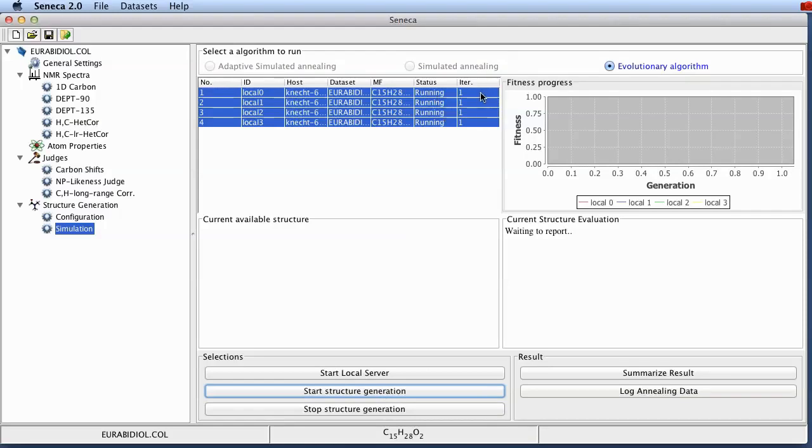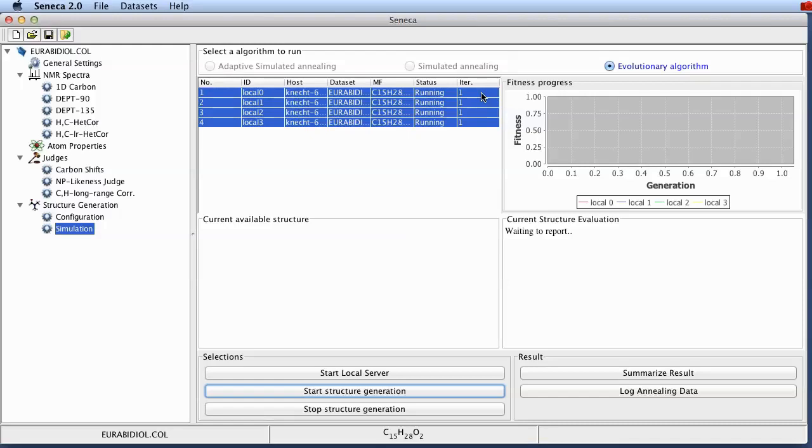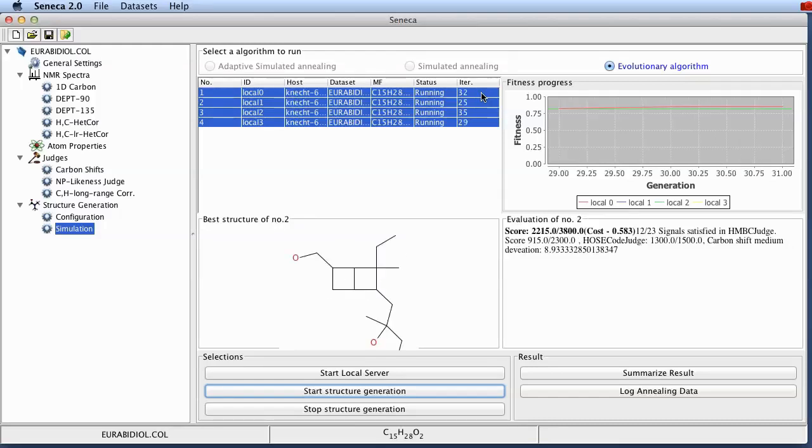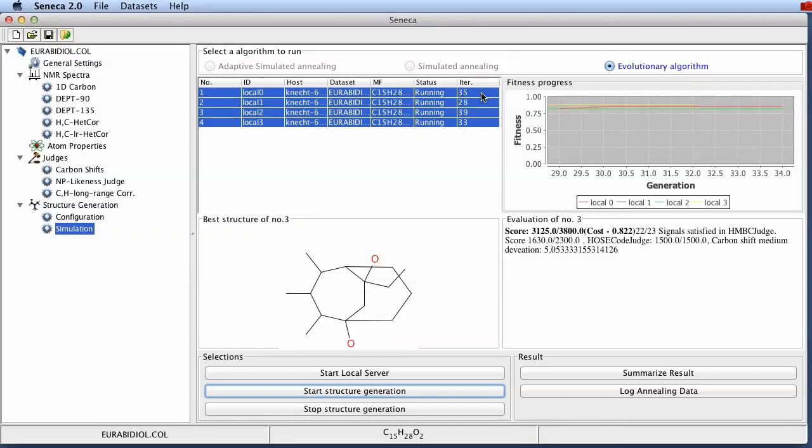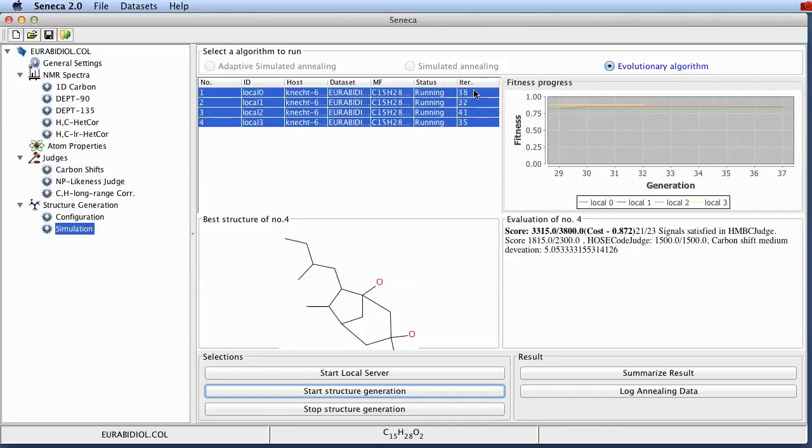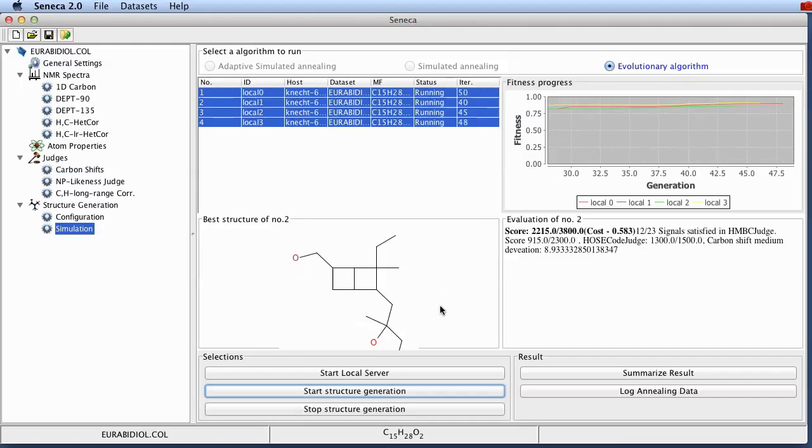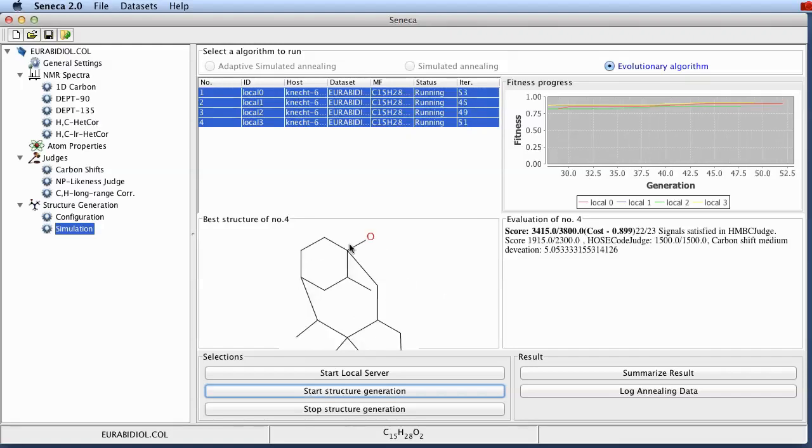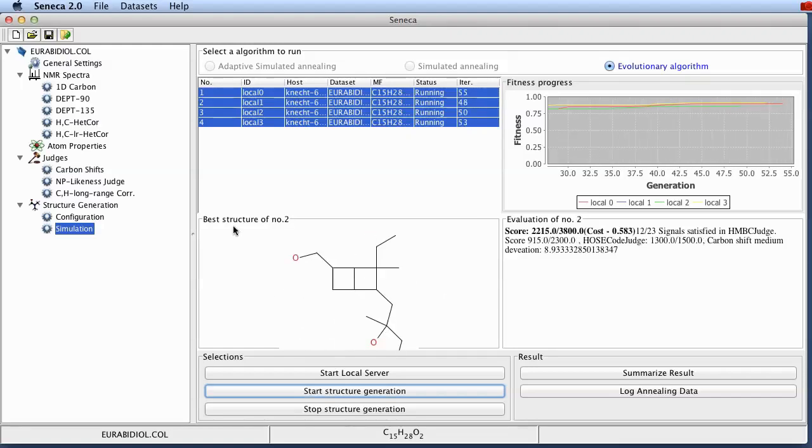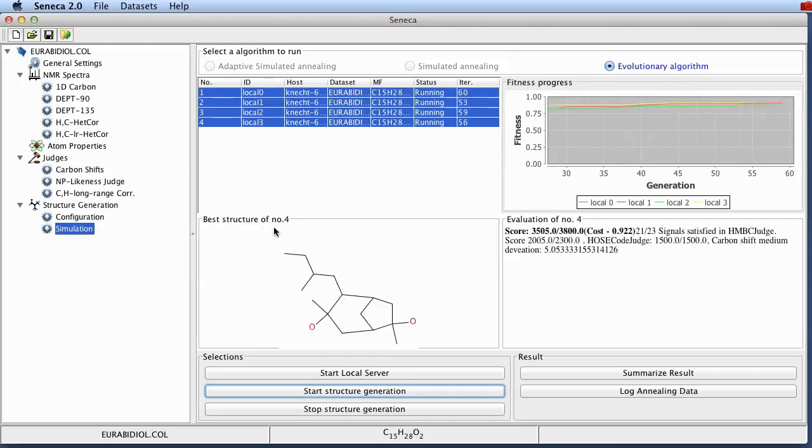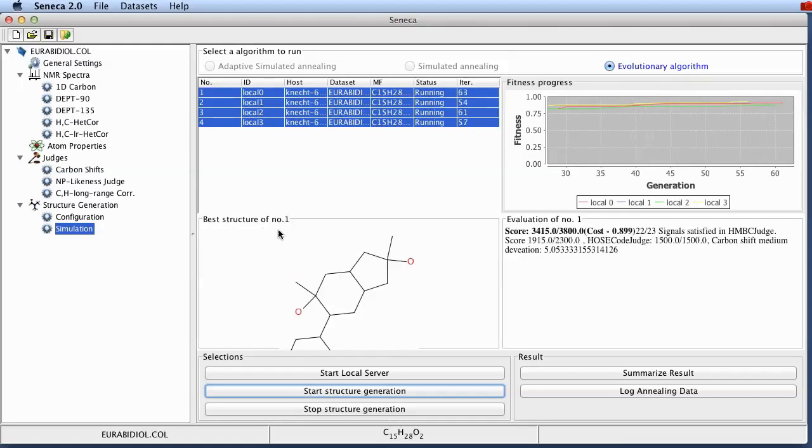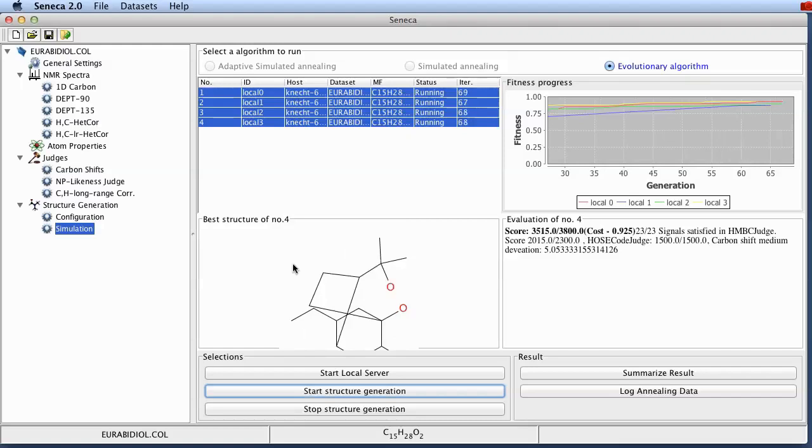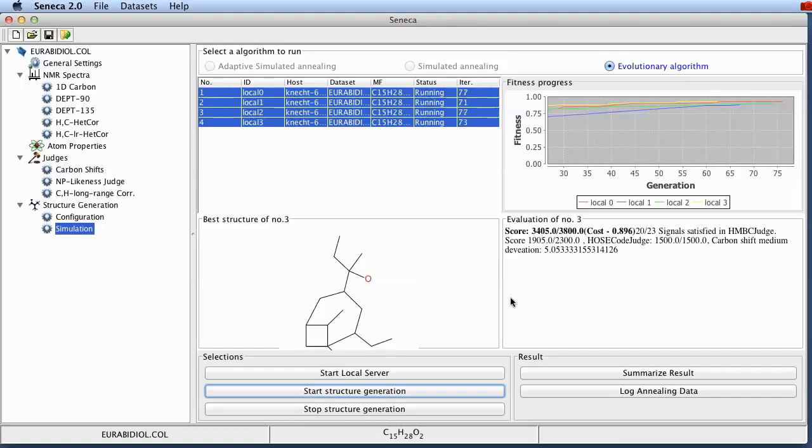And you can see immediately the status of all of those four servers is switching to running. And over here in the last column you see the number of iterations performed. The whole computation takes a while to get started but then the optimization is going quite smoothly and quickly. Over here you can see the course of the iterations showing the numbers. Down here you see the best currently found structure for each of the local servers. The application is cycling through the optimization on the different servers.